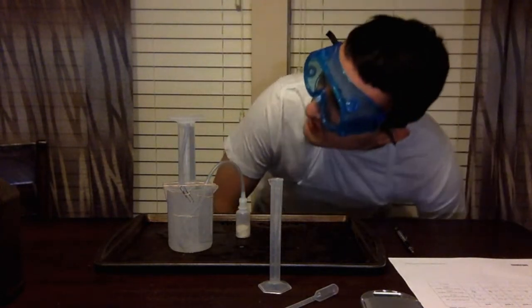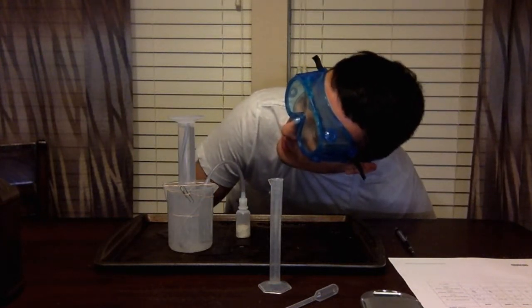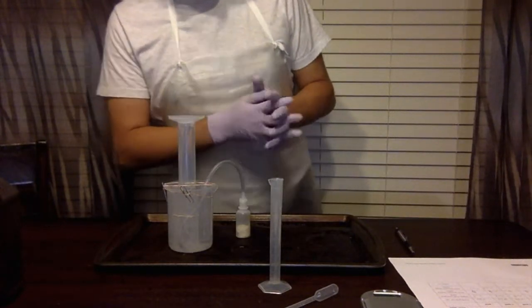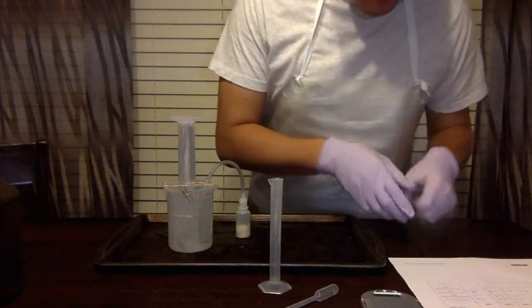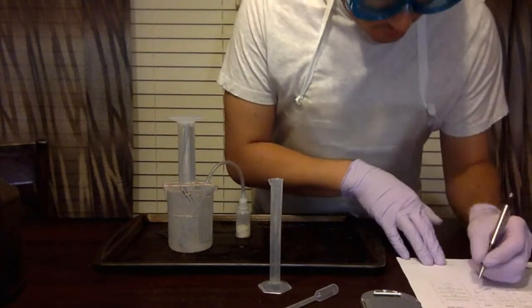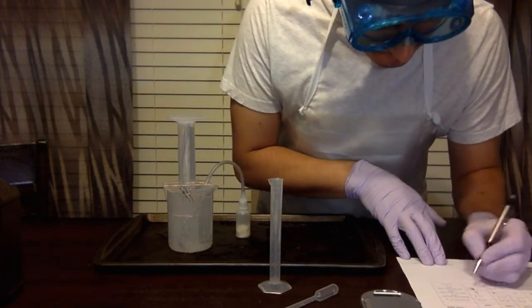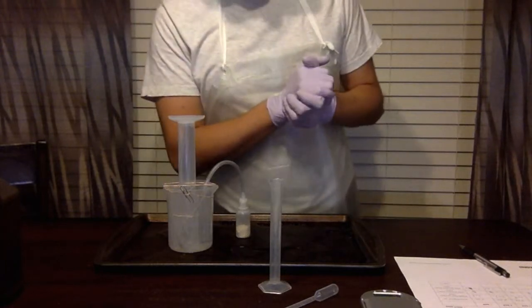All right, now we're back, and we're going to take a look at how much O2. It looks like we've accumulated a little bit over 2 milliliters. So we're just going to say it's 2 milliliters, and we're going to go ahead and record that into our trial one under the data table.